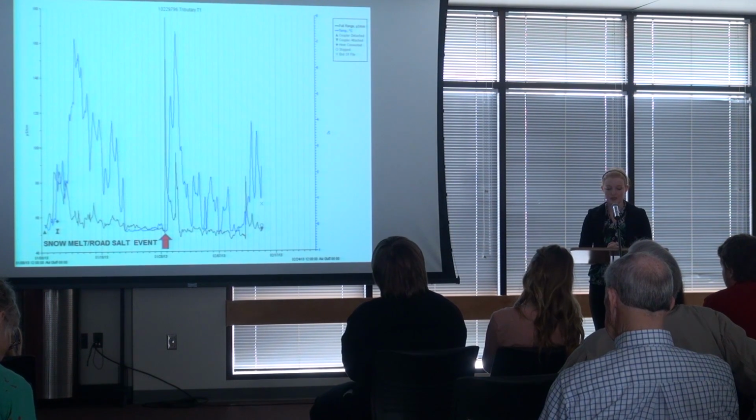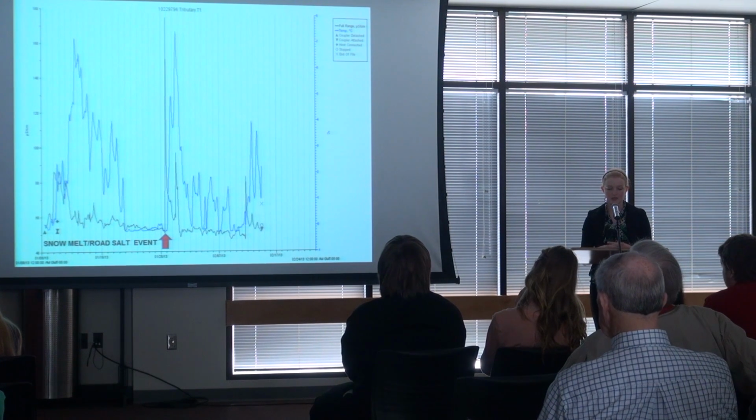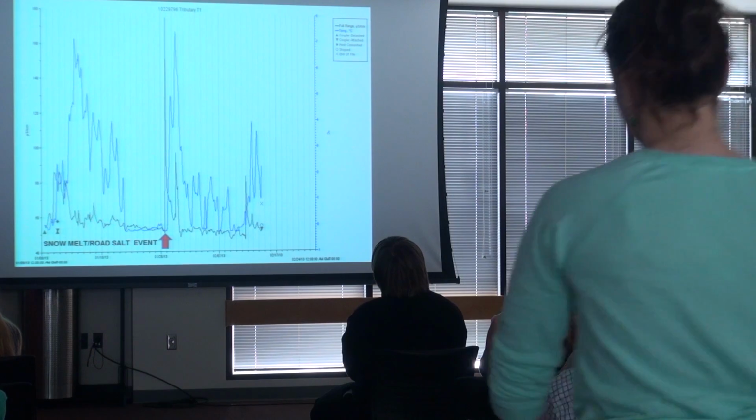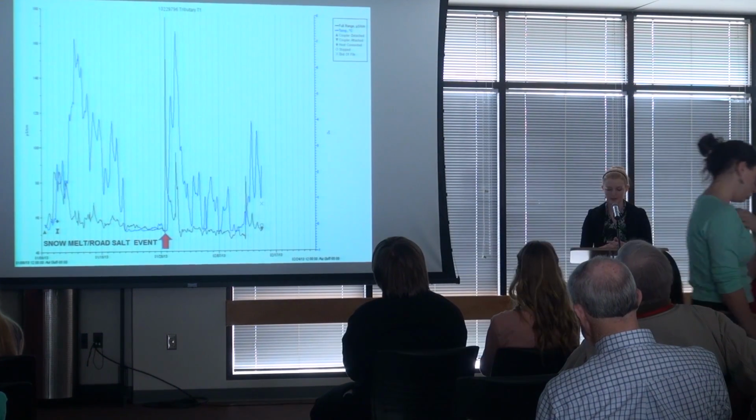This next graph is different from all the others because this graph displays our continual data retrieved from our HOBO conductivity loggers. These meters have been placed at 6 of our 8 sites and measure the conductivity of the sites every hour on the hour. This allows us to monitor our tributaries without having people in the field at all hours of the day.